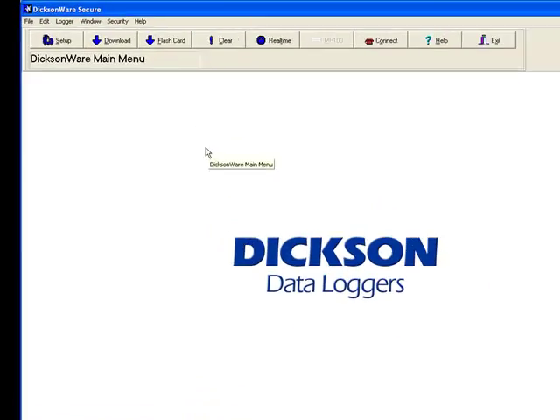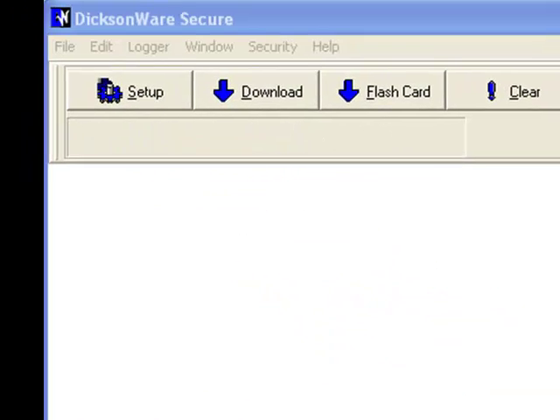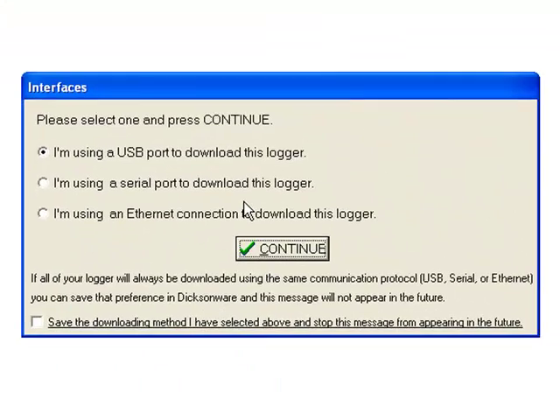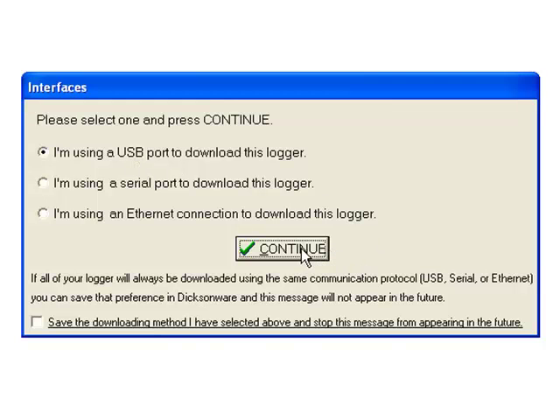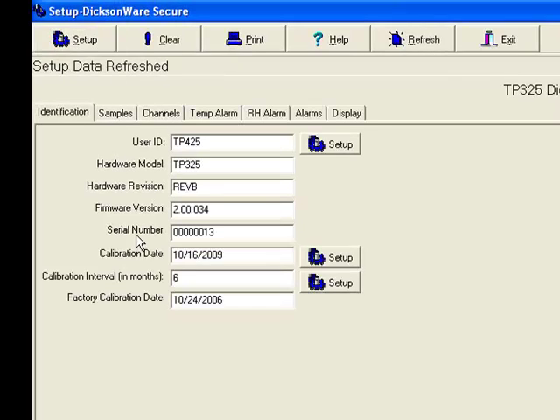To set up your logger, you click Setup. I'm using a USB port to connect to my logger. Click Continue, and it pulls information about the logger.